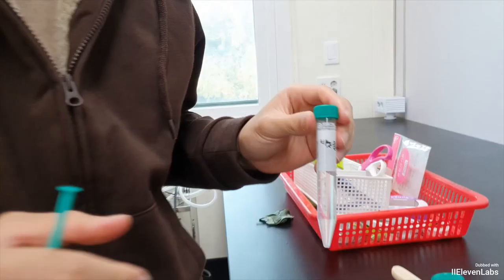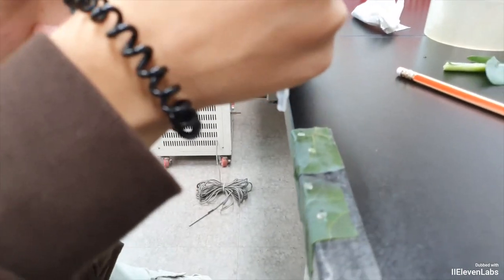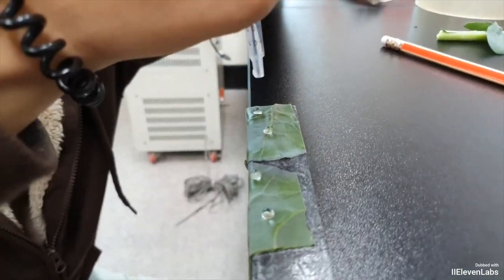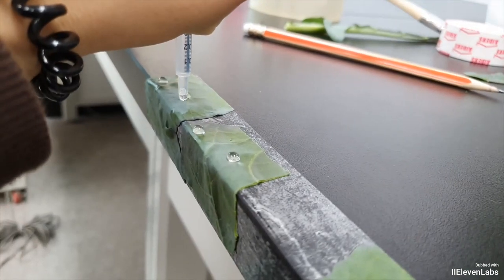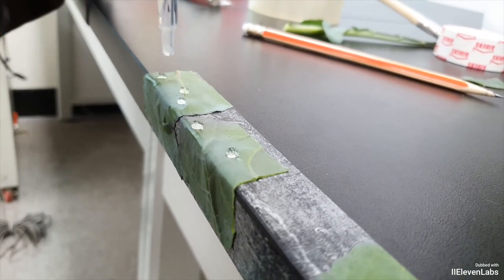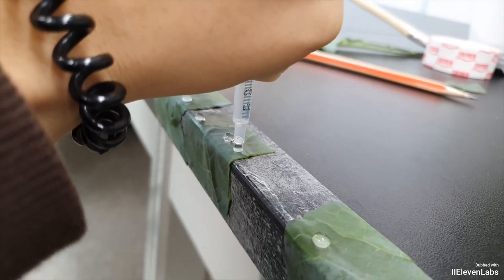The next step is to use the prepared 0.1% soap solution and apply it to the wax surface in the same manner to measure the contact angle. This will help students understand the role of surfactants. Soapy water acts as a surfactant, helping water droplets adhere better to the waxy surface of plants.